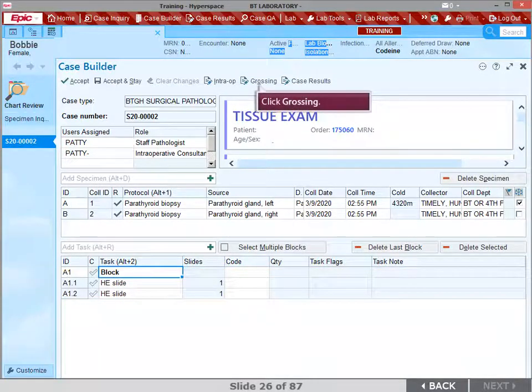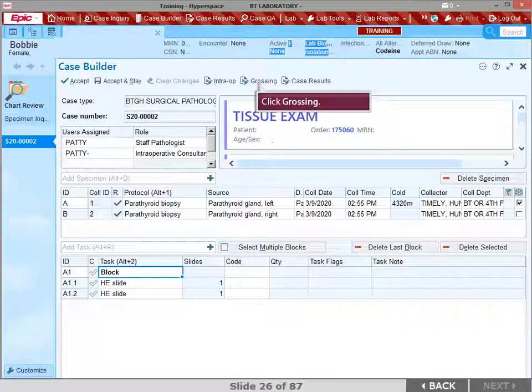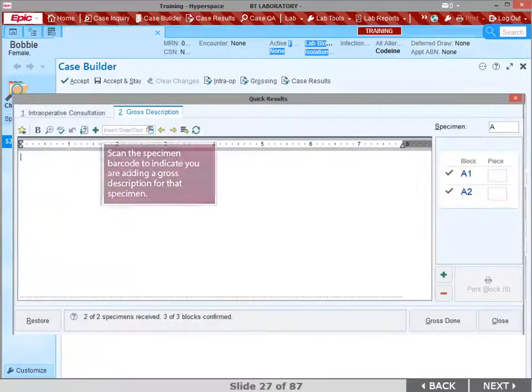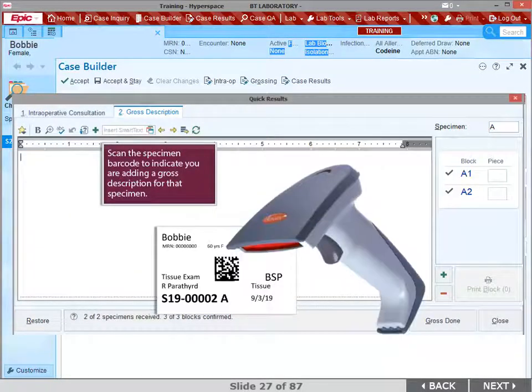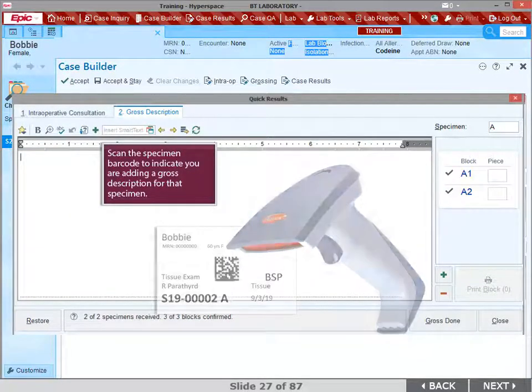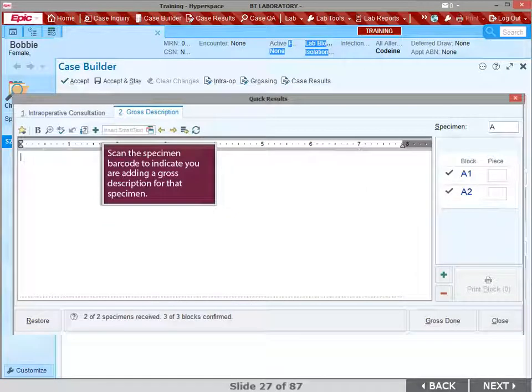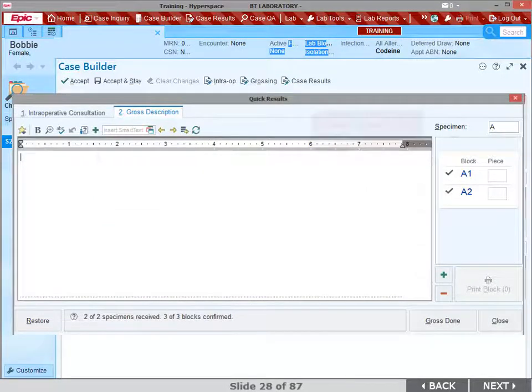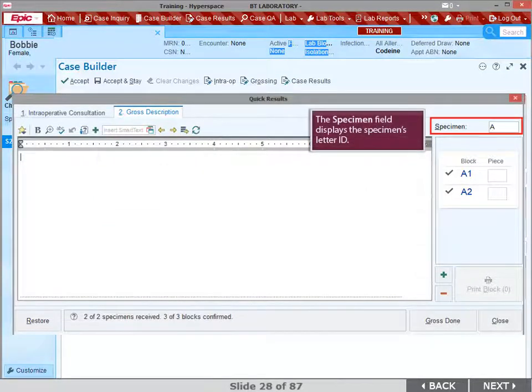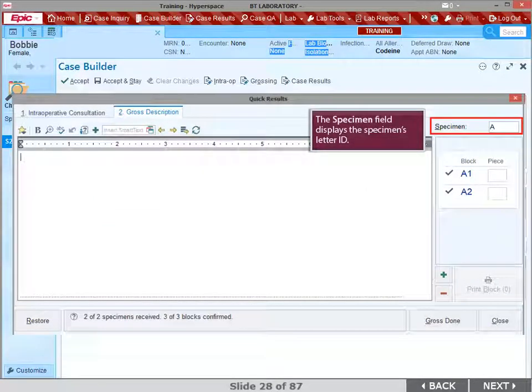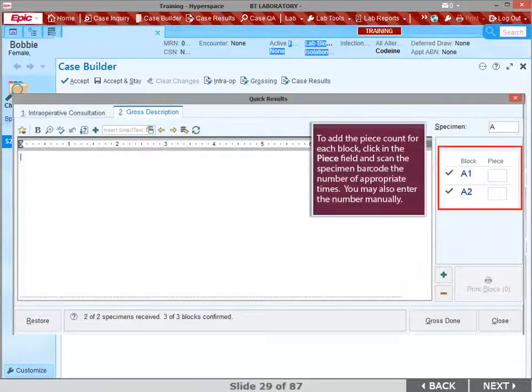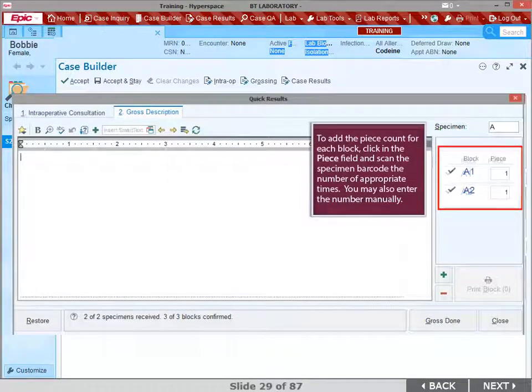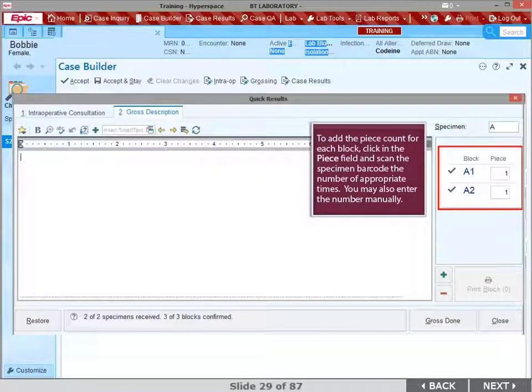Click Grossing to add a gross description. You can scan the specimen barcode to indicate you are adding a gross description for that specimen. The specimen field displays the specimen's letter ID. We also added the piece count for each block.